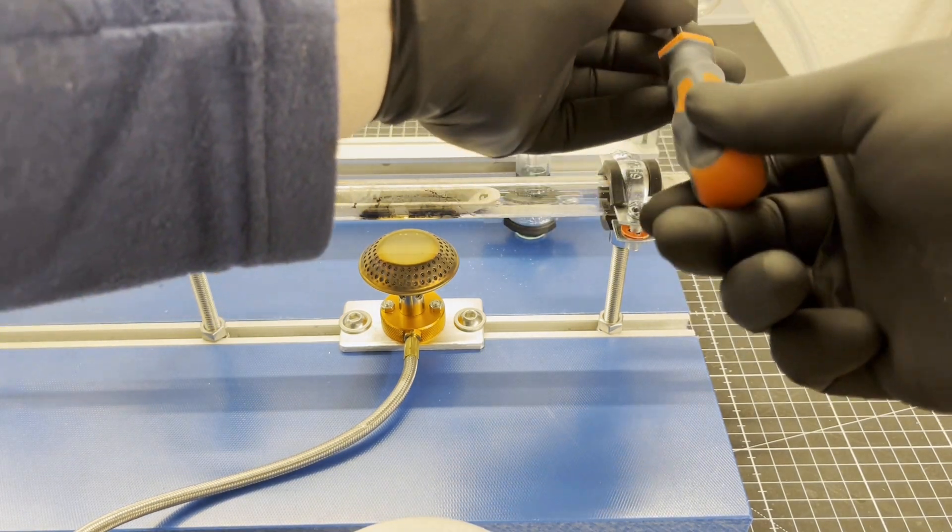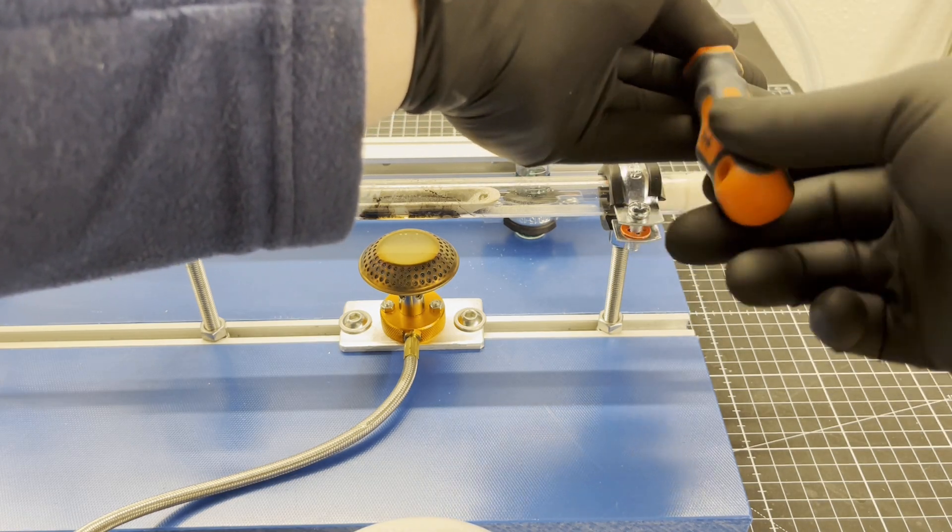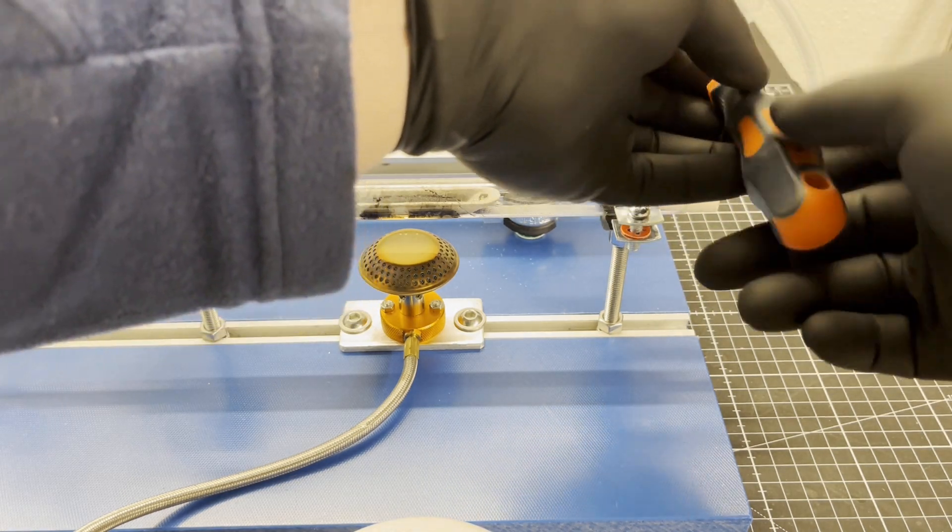The industrial Haber-Bosch process, of course, uses much higher pressures and better catalysts, which greatly increases the yield.